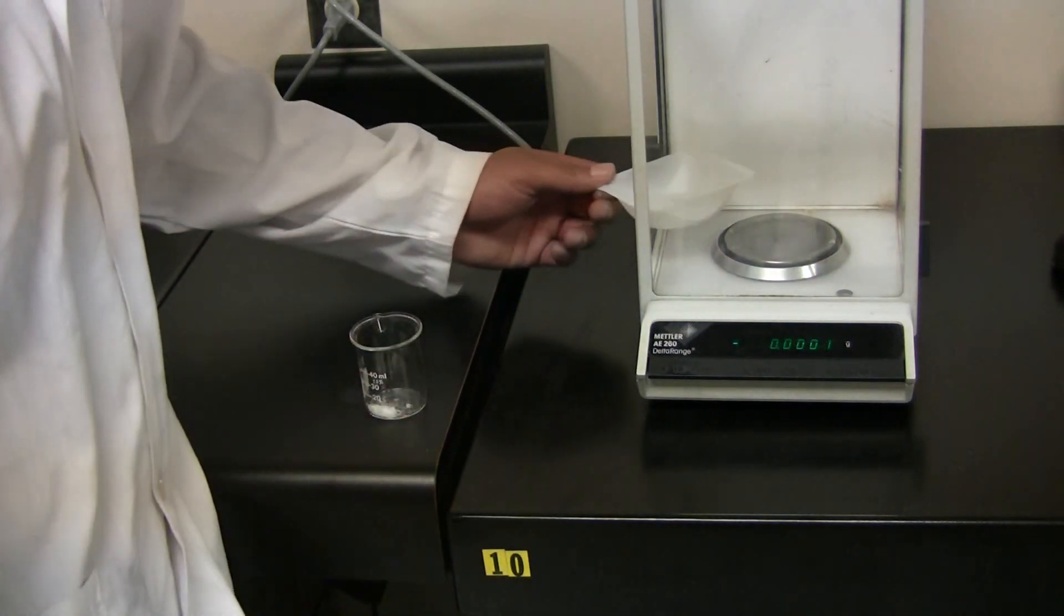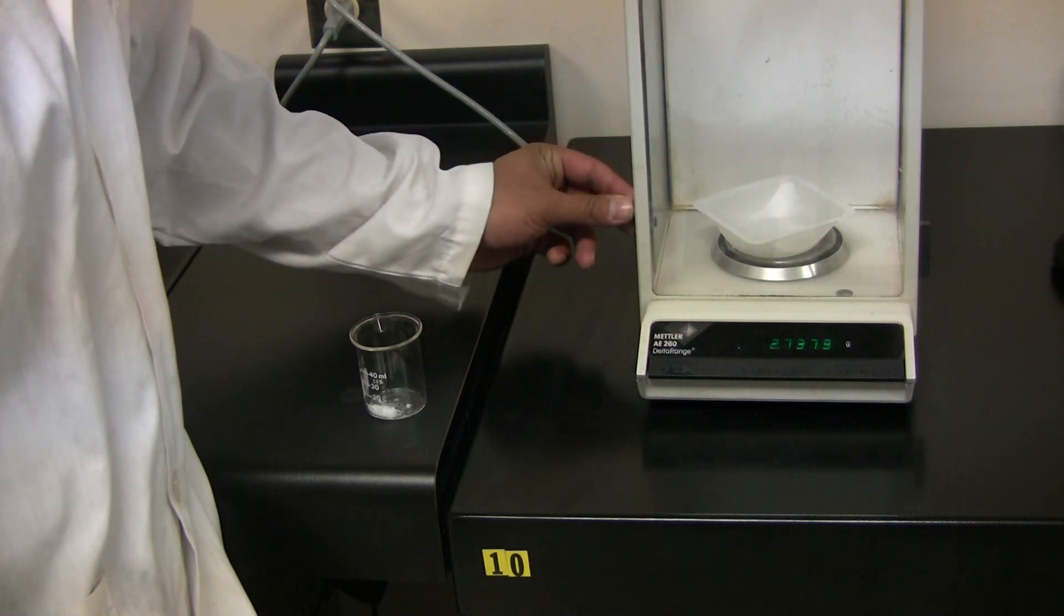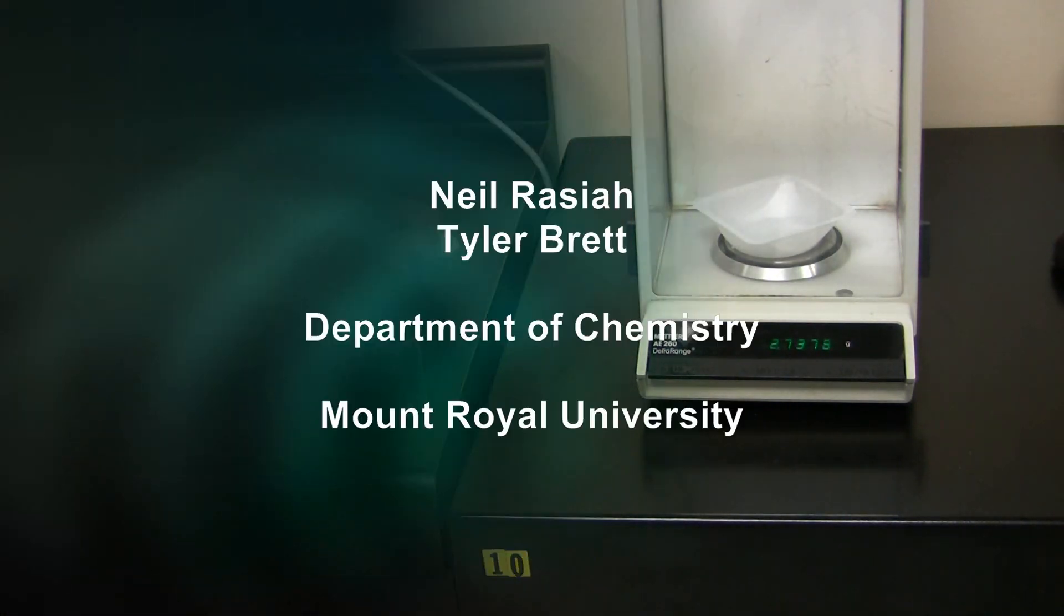Next, replace your weigh boat with residue into the analytical balance. Close it and record this value.